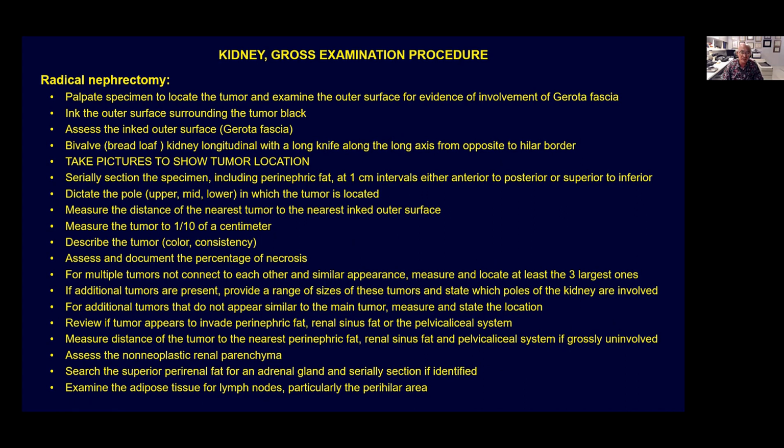And if I don't find a picture in a case, either because COPATH didn't register it, or sometimes the gross examination says that pictures were taken but they are not present in the file, we need to request that the picture be included. And if the pictures are not mentioned as taken and not in the report, then we want to ask you to go back to the bucket and take some pictures, because that is extremely important documentation nowadays.